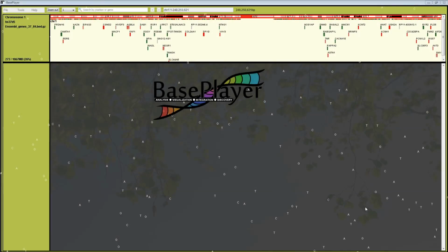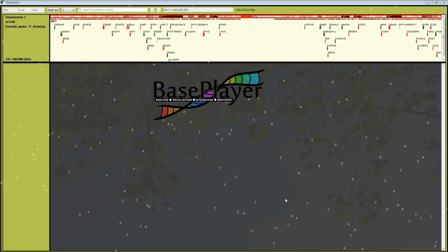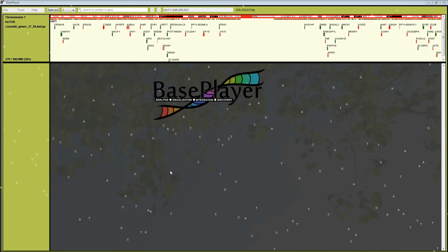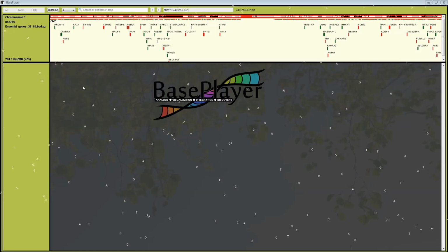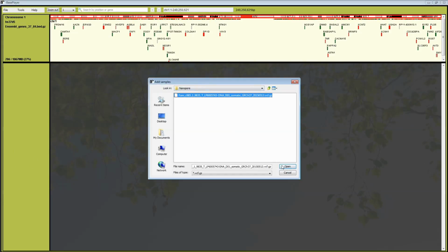Okay, hi there. So in this video, I'll show you how you can visualize and analyze long reads with third-generation sequencing data. Let me first demonstrate the case with Illumina's paired-end short read data. Okay, let's open our samples.